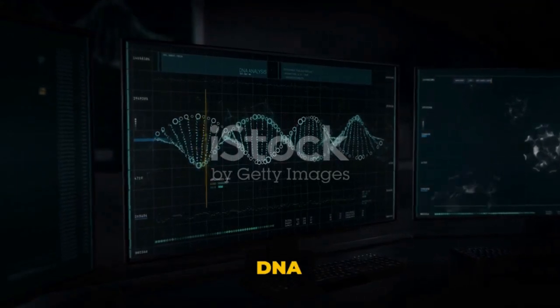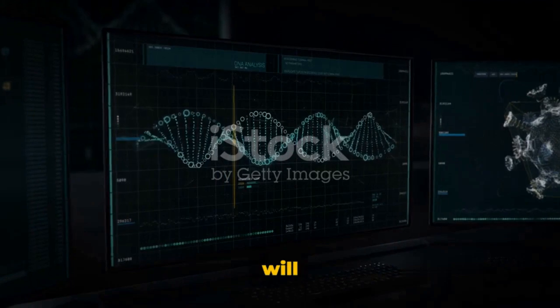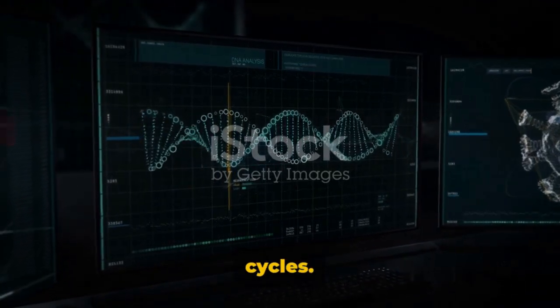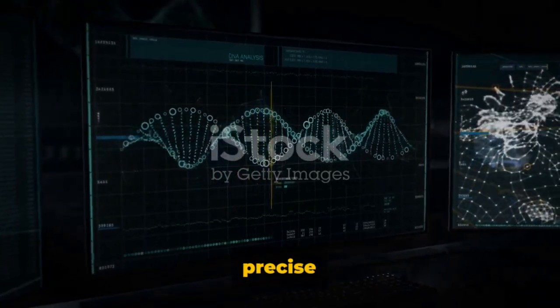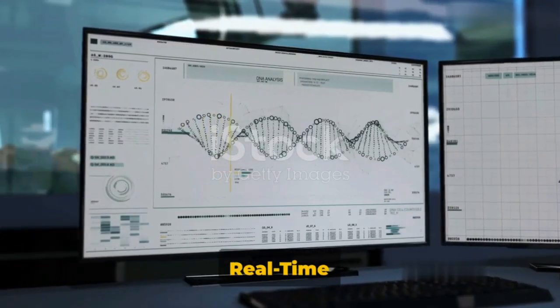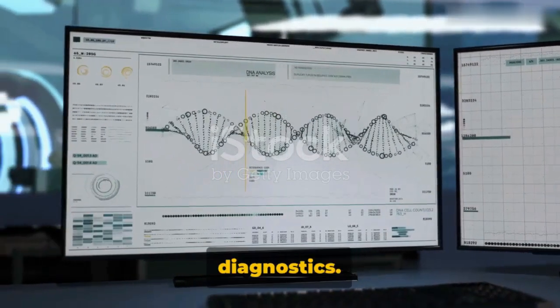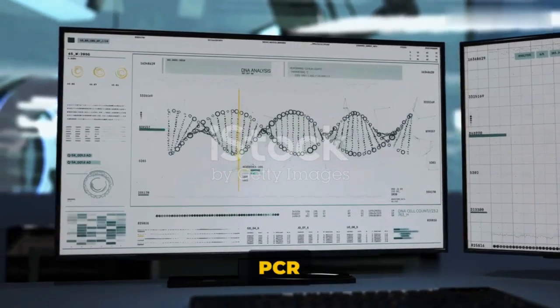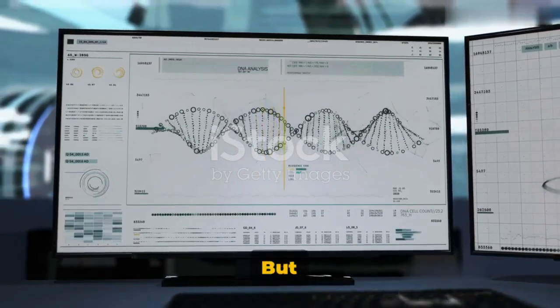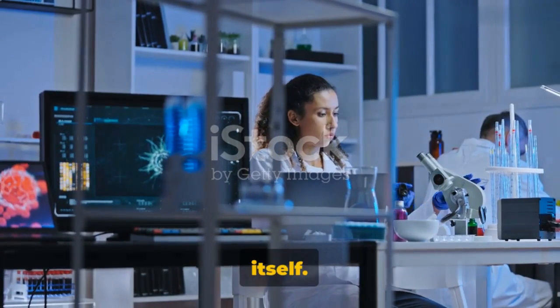So, the more DNA there is in the sample, the brighter the fluorescence, and the earlier it will be detected in the PCR cycles. This allows for a precise quantification of the starting amount of DNA, making real-time PCR a powerful tool for many applications in research and diagnostics. As we have seen, real-time PCR is a fascinating process, but how do we interpret the results? Interpreting results from real-time PCR is an art in itself.